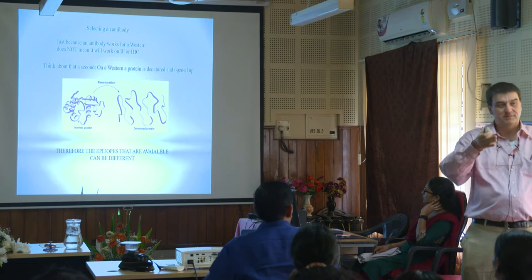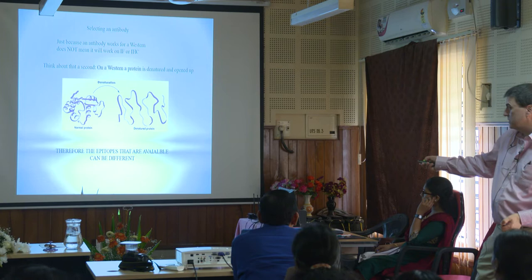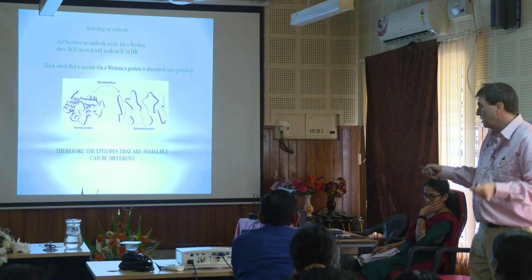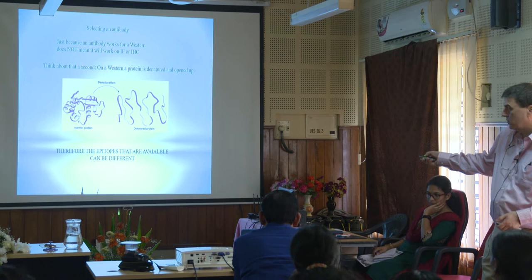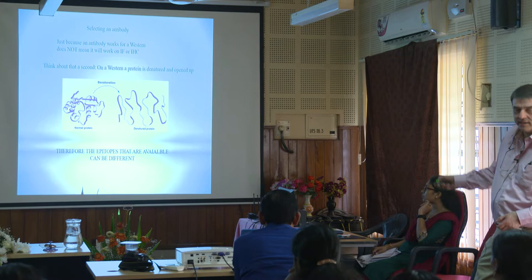You grind it up, right? And then you denature it. You run it through a denaturing gel. So when you denature a protein, you sort of destroy this structure and you sort of make it opened up a little more. So now you've exposed all these other little epitopes that here might be hidden in a fold. Like in the immunofluorescent world, your epitope might be hidden, but the Western blot antibody can come in and recognize that, but if you try it over here, it's hidden, right?